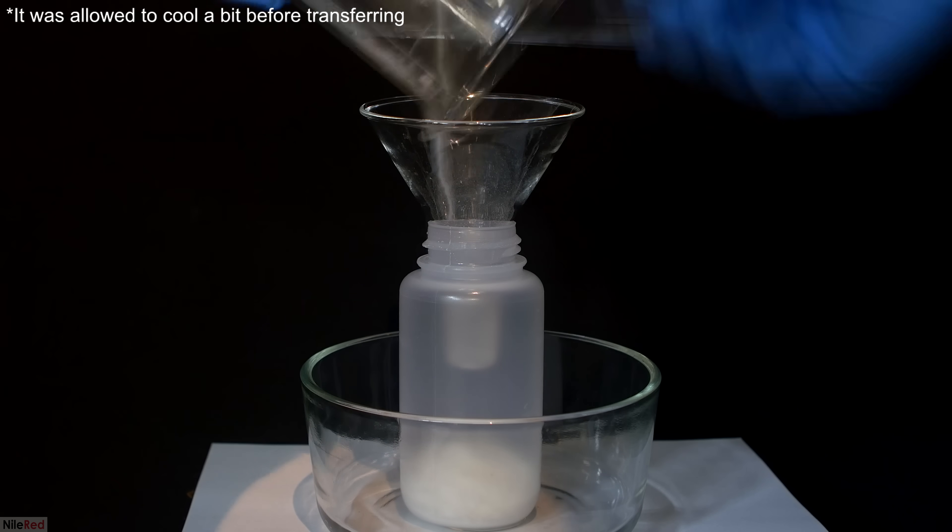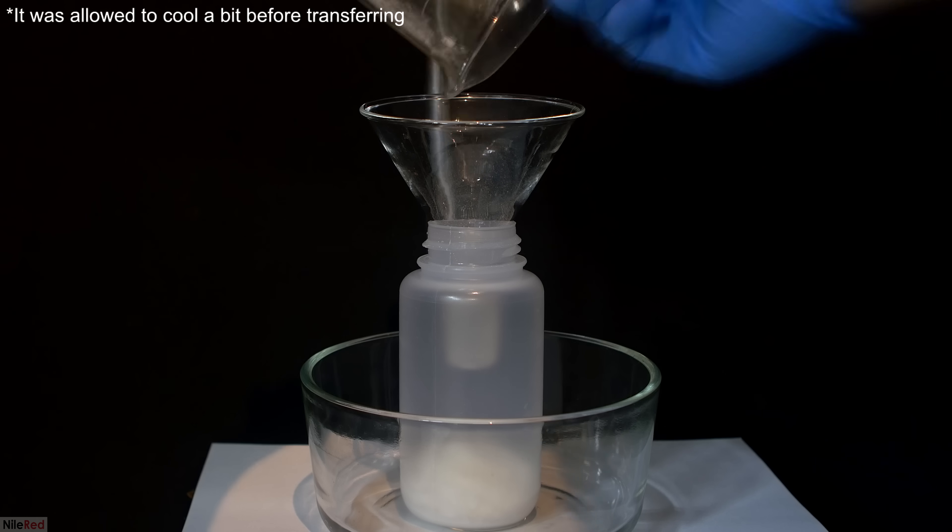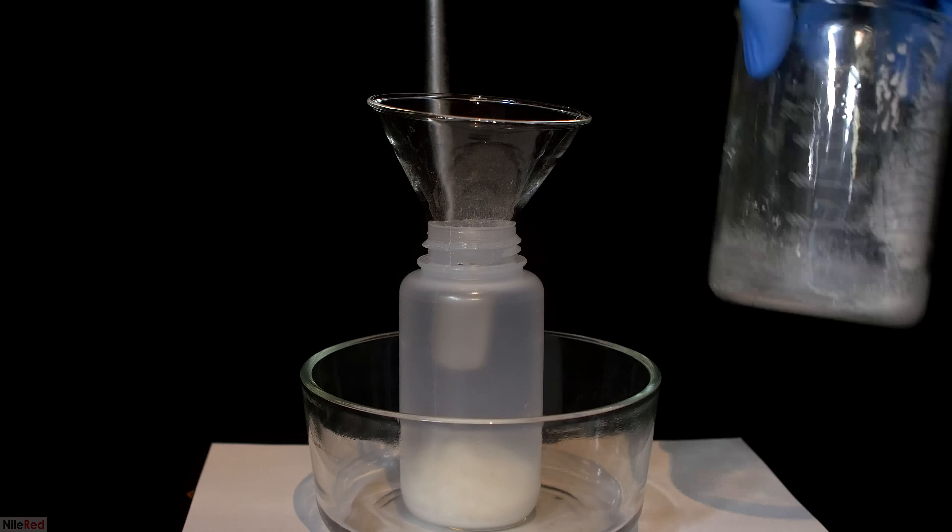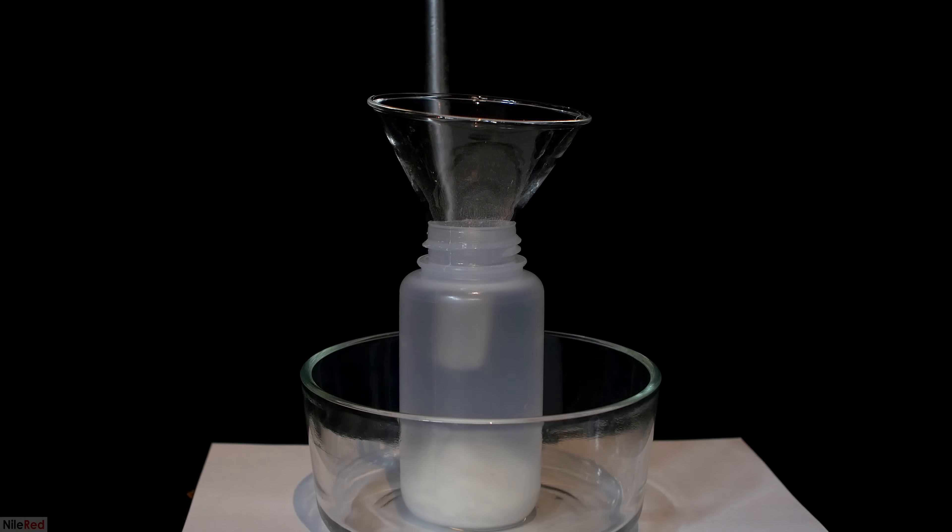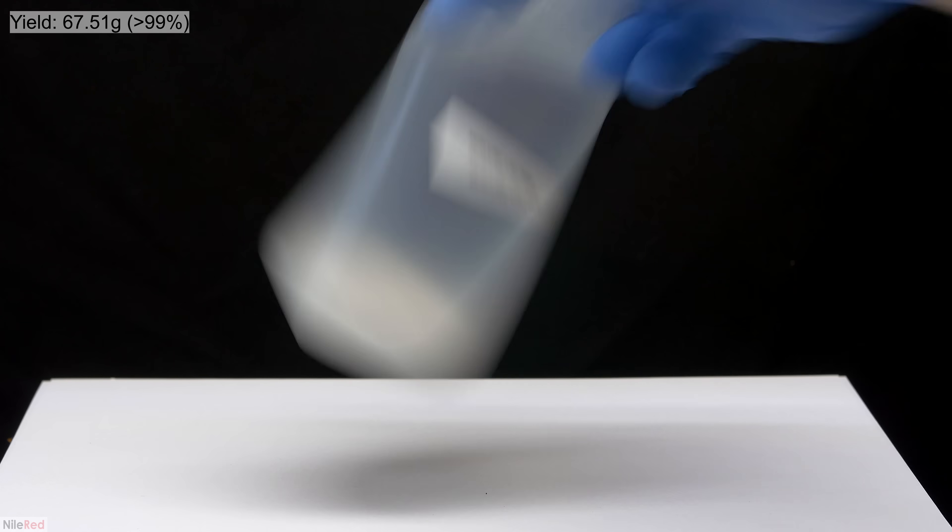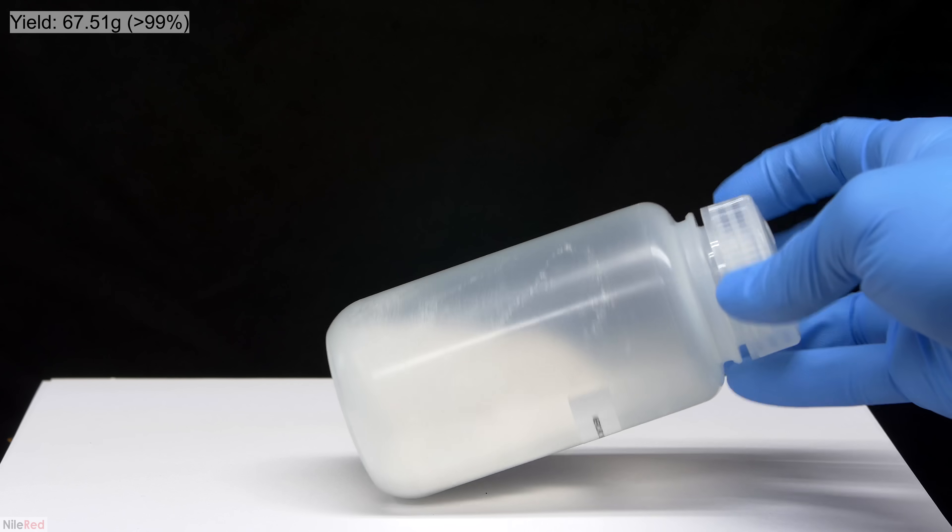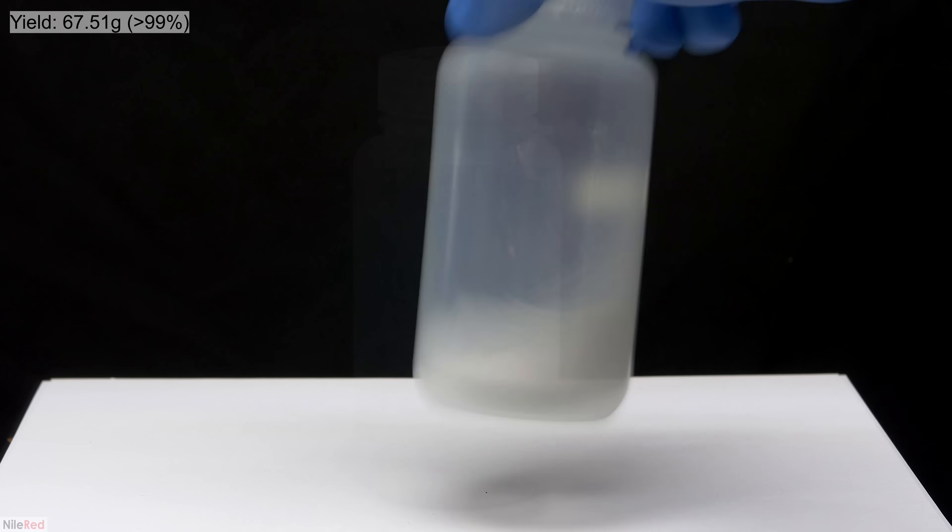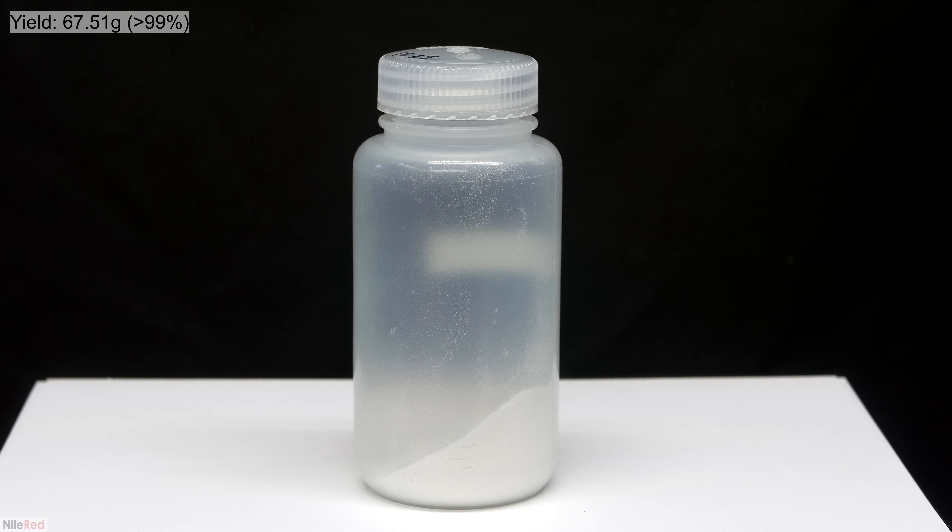I leave the mercuric chloride on heat for a little bit to fully dry it up, and then I transferred it to a bottle. The beaker still contains some mercury salt, but I decided it wasn't worth my time to try to recover it. The final yield of mercuric chloride came out to be 67.51 grams, which represents a percent yield of a little over 99%. I was very glad to get such a high yield because when you work with mercury, you really want as little waste as possible.